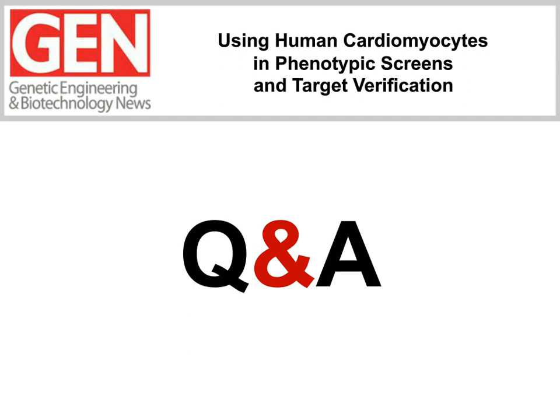Well, the short answer is we don't know the endpoints yet because it's the phenotypic screen. We hope that we're identifying, there's about 7 scaffolds that we've identified so far that we're moving forward with. And the hope is that those may have different endpoints, and that's the advantage of a phenotypic screen, that it is open to different pharmacology.